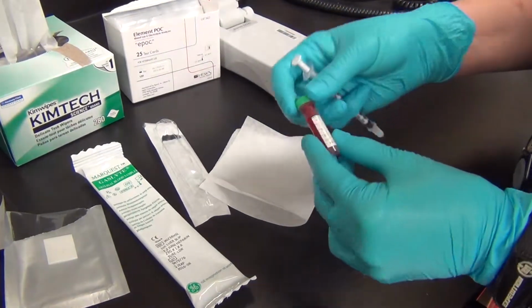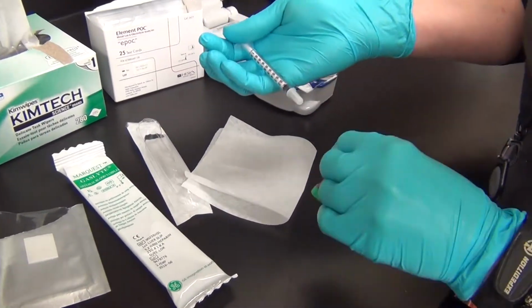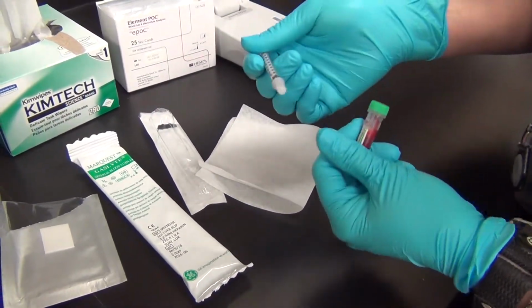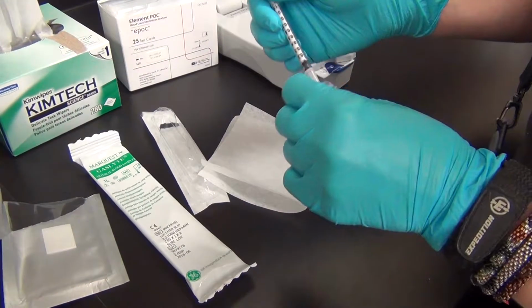Since I have a green top here that was drawn from a dog, I'm just going to mix it some, and I have a 1cc tuberculin syringe. We're going to be using the ones that come without needles because they're less expensive. We will keep a supply here stocked in the laboratory for that purpose.